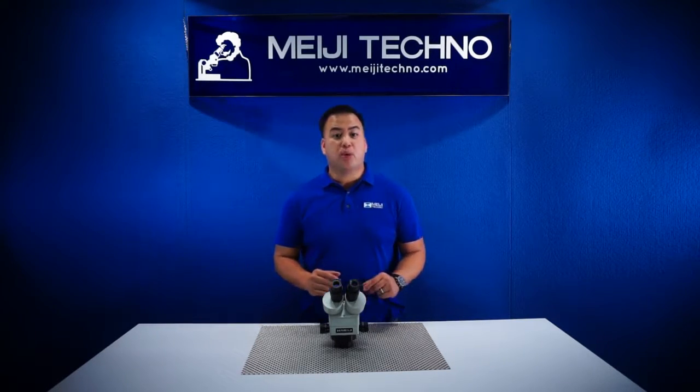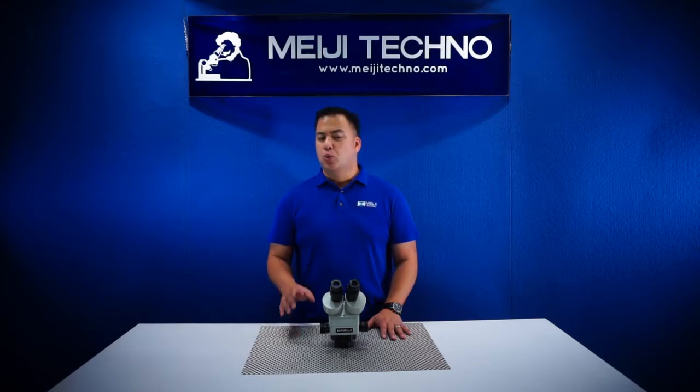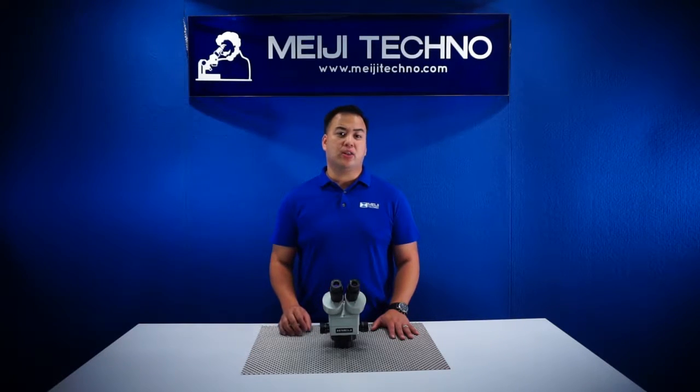Just like all our other models, our EMZ-13 is built with an all-metal cast aluminum alloy with chemical resistant finish. The EMZ-13 provides a long-lasting life, superior quality, and it's really built like a tank — and that's the reason it comes with a limited lifetime warranty.